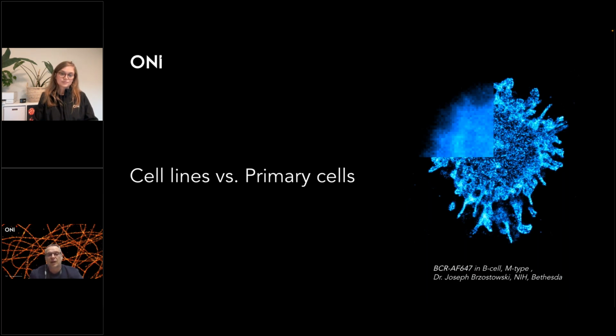Some fluorophores, for example PE, are very commonly used in FACS or flow cytometry, where when you scan it, you get one shot. It's very rarely used in microscopy, though sometimes it is used in confocal microscopy. However, for single molecule localization microscopy, that dye is not suitable. There's a dye selection list, which depends on your imaging buffer and the technology you're using. But overall, there's not really a different labeling strategy for your sample compared to, for example, confocal microscopy.